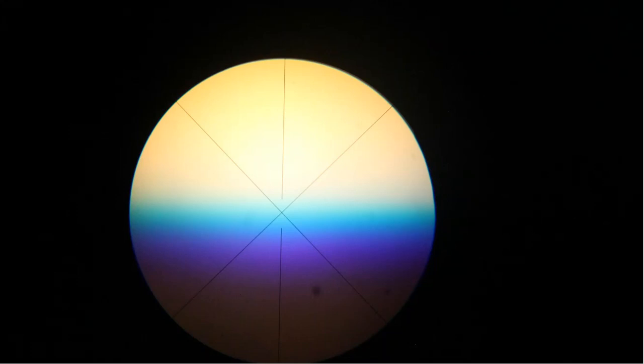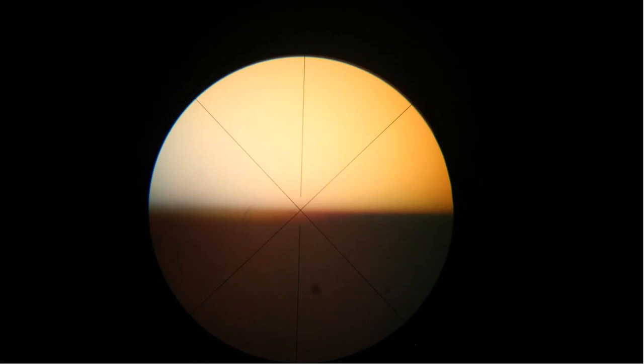I'm going to take the fine adjustment tool, and slightly turn it left or right until I end up with something that looks like this. Here is a very good defining dividing line. The light half on top, the dark half on the bottom. If they are not perfectly matched up with the crosshairs, which is right here, that's where the dividing line should be, then I need to move that line up or down.